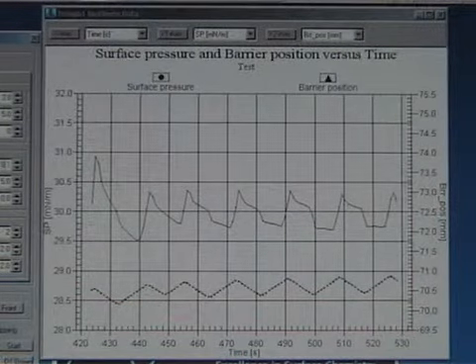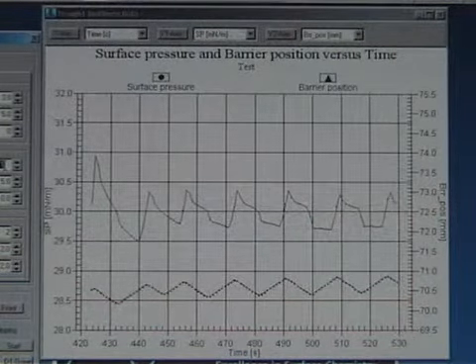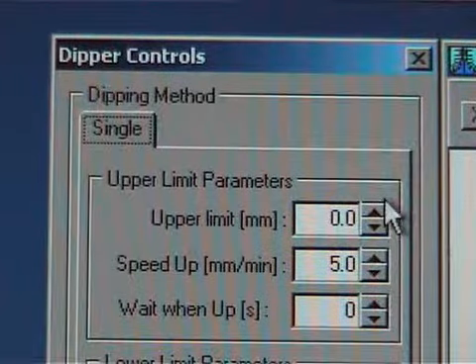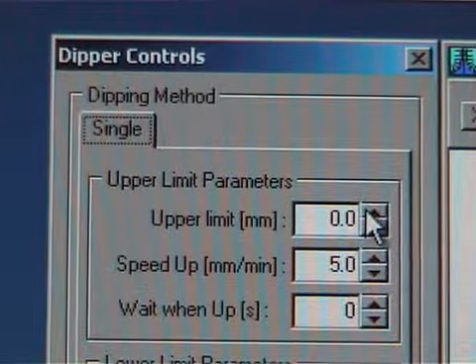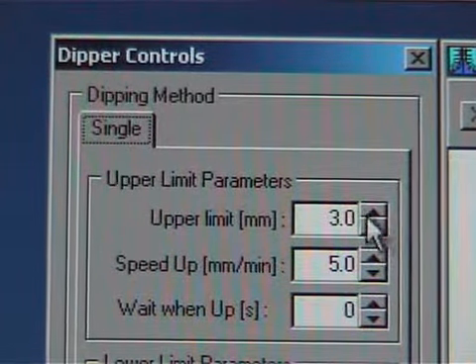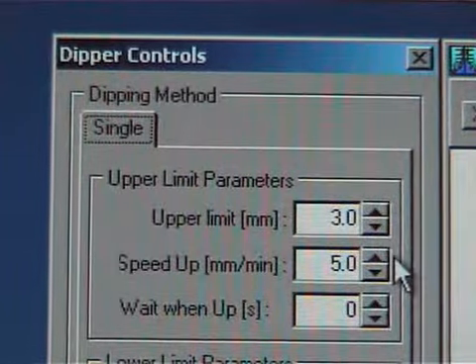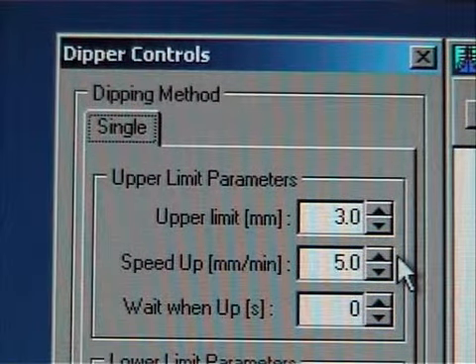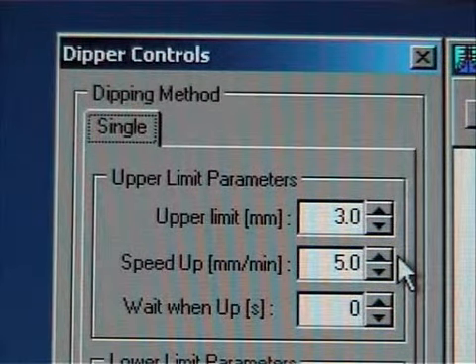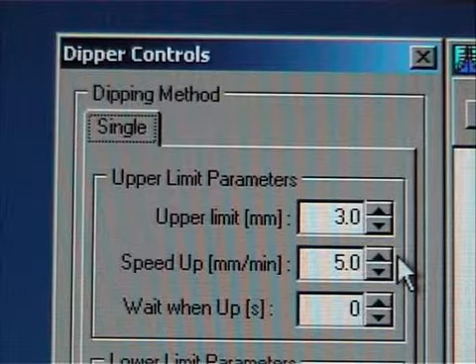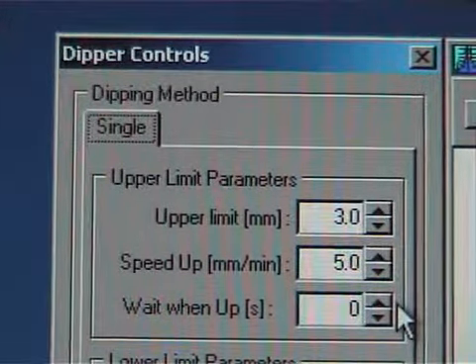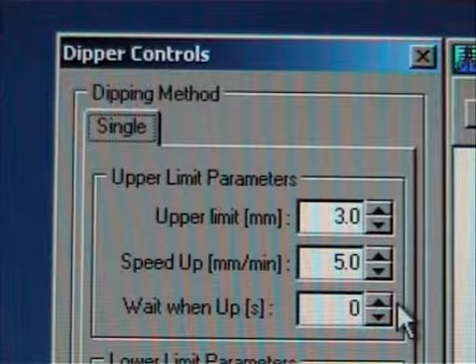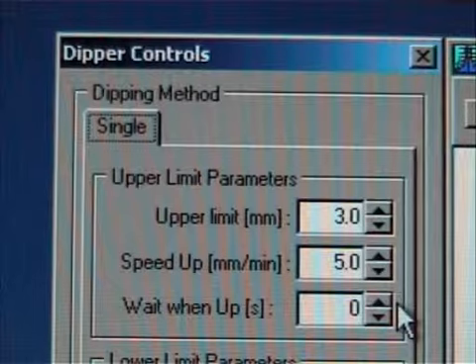The upper limit should be set so that the sample doesn't touch the surface at all. The speed up value is the speed of the dipper arm when the sample is lifted and usually 5mm per minute is suitable. The wait when up value is the time that is waited before a new dipping is started and is only used when multiple cycles are done.